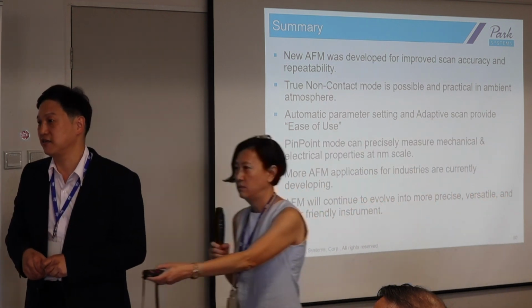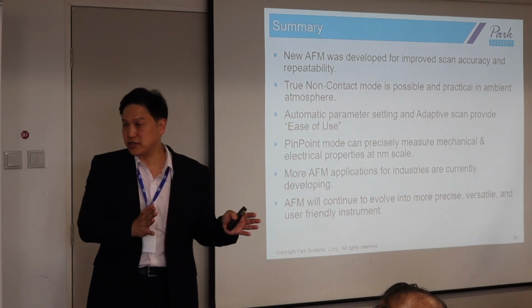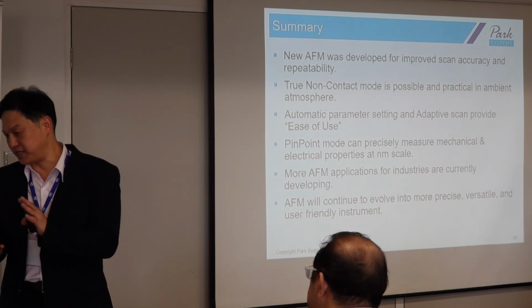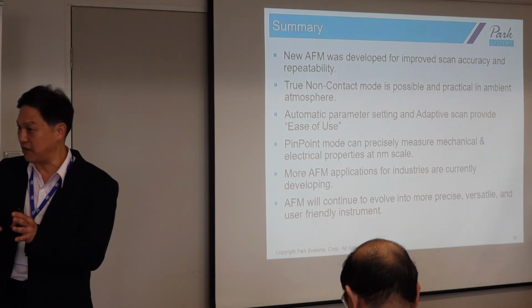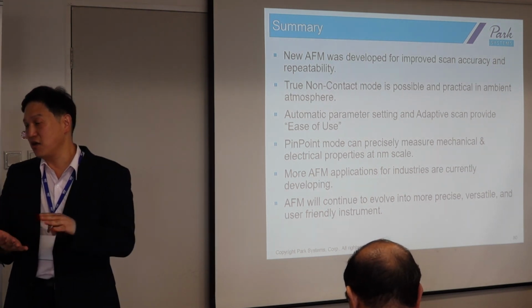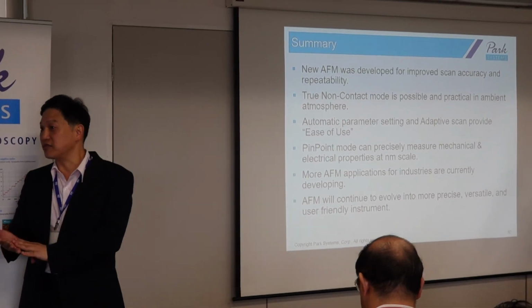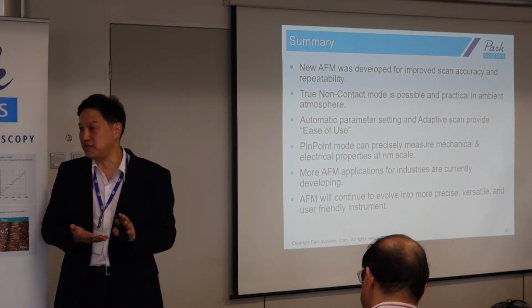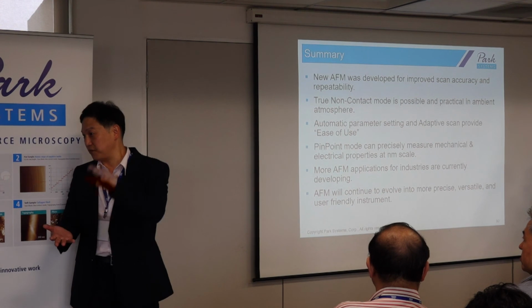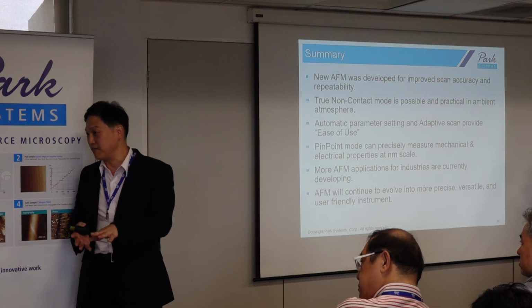Technically, what is the difference between normal contact AFM mode and this pinpoint mode? In contact mode, to scan, the tip just travels and responds. It detects the tip-sample interaction with the servo system to image it, but we cannot control the contact time and dwelling time. Once you determine the set point, a certain force is applied to the sample constantly, and you are not changing it. But many samples are complex structures, and they respond differently to the force. So we need to control the force at each point, and then we can control the contact time, the dwelling time.